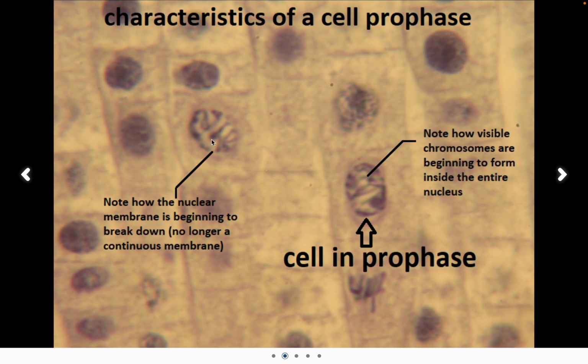In this one right here, you can actually see that the edges of the cell, the nuclear membrane, are actually starting to disintegrate. You can't actually see the edge here. It was very dark, very clear that you had a nucleus. Here, you're starting to lose that, right? Maybe it's getting a little bit bigger. It's starting to stretch out a little bit, but definitely it doesn't have that kind of darker spot in the middle. You can notice in some of these, like this one up here, there's your nucleoli, right? So inside of your nucleus. And so this is prophase, where you can start to see those strands forming.